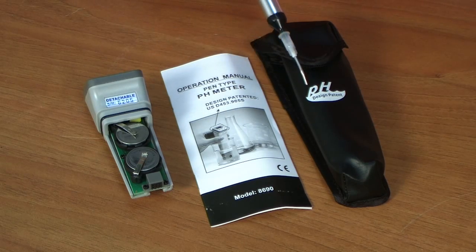The pH meter is supplied with two batteries of type SR2032, a manual, and a protective case. The device can be used for measuring pH levels in drinking water, aquariums, swimming pools, in industrial water treatment systems, and during laboratory tests.